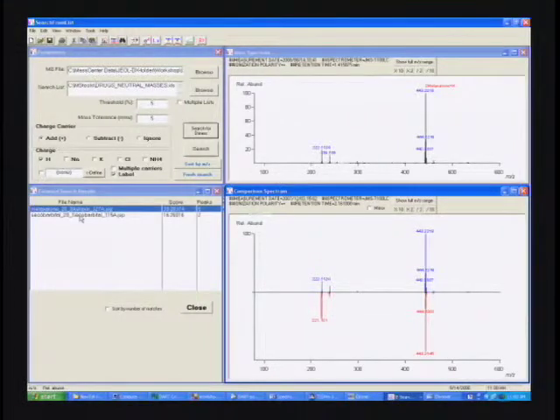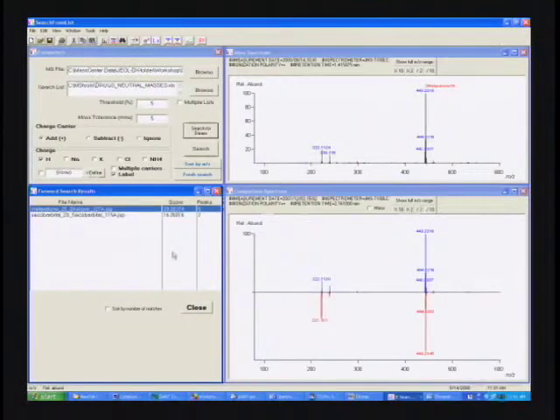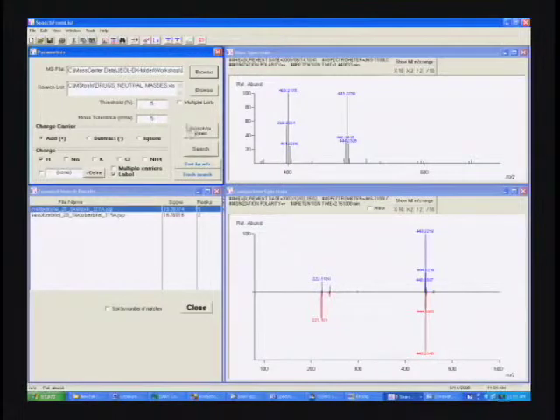Now we also think that there may be secobarbital present based on the empirical formula search we did first. So we'll look at that, and we'll notice that the peak that it labeled as secobarbital probably is not secobarbital, since secobarbital will give a large 239, and certainly this 169 does not show up at all in this particular spectrum. So I think we can feel pretty good that the metaxalone is probably our best guess here for what we've got. Now we'll check that by going to the 60 volt data, and let's go ahead and look at that.